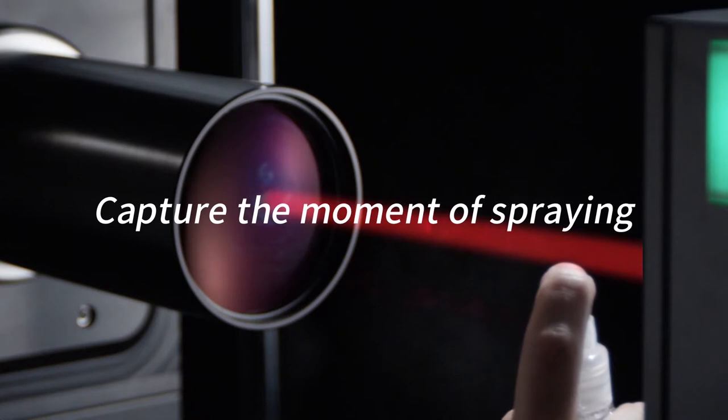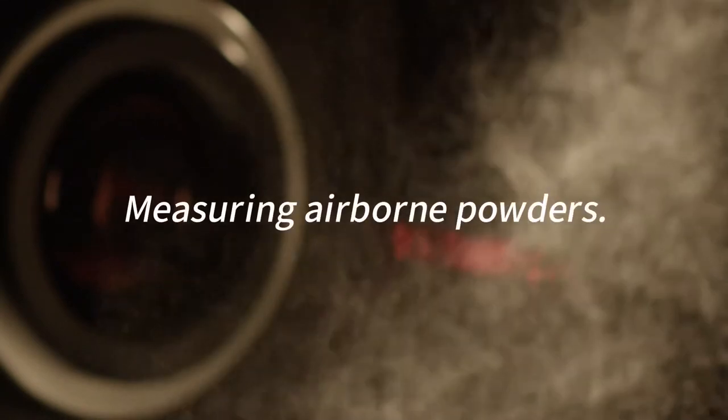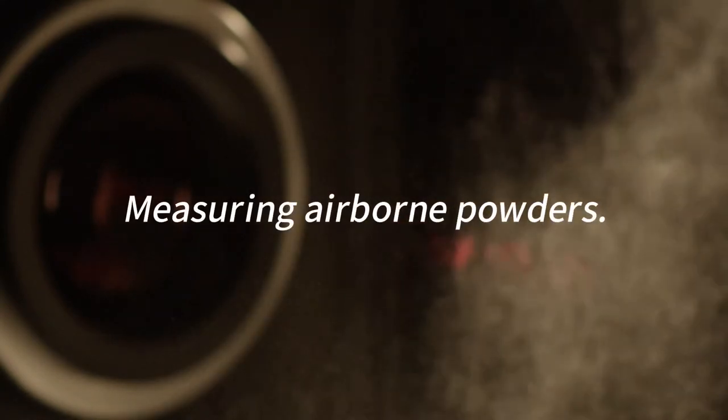Capture the moment of spraying with Aerotrack 2. It is a device for measuring airborne powders and particles such as droplets from sprays or mists.